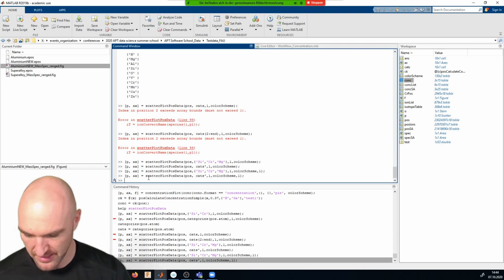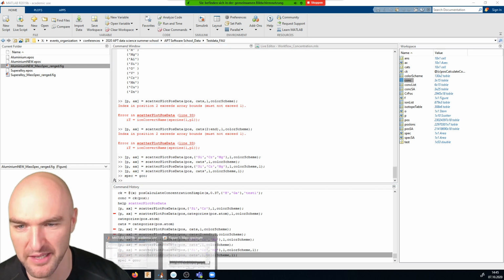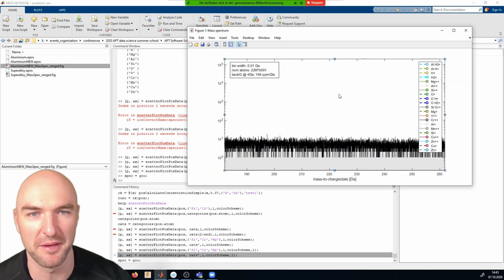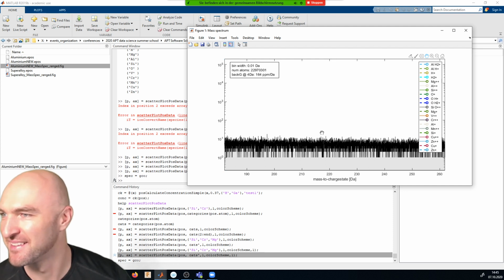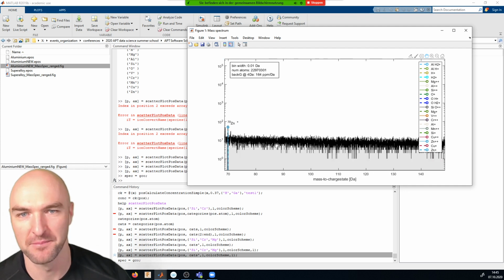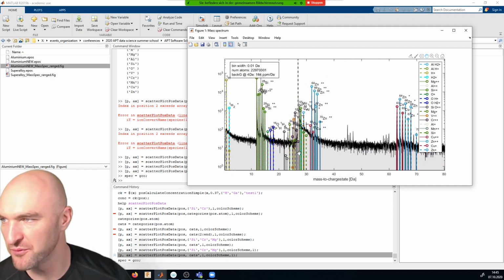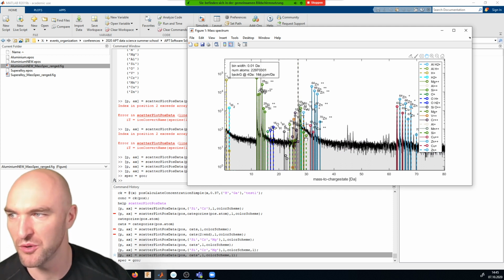But this is the typical intuitive thing where people immediately got lost. I at least got lost. Yes, and I'm sorry for that, but if someone like you got lost, then I assume a lot more people got lost. That's humbling, but I think there's no specificity. I'm always slow with these kinds of tutorials. Yes, but that's a side note. No, thank you. So Martina just wrote, if you're lost, just ask the host or a co-host if they can help you. Thank you. Yeah, great.